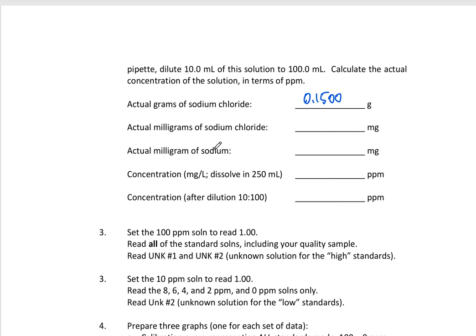or 151 something. That really just depends on you and what you measure out and what you do for that particular type of thing. And that's okay. No one says it's got to be perfect. Just track it. That's all that you need to do. So I'm going to pretend I was perfect, even though I'm not. And then I will measure out 0.1500 grams.